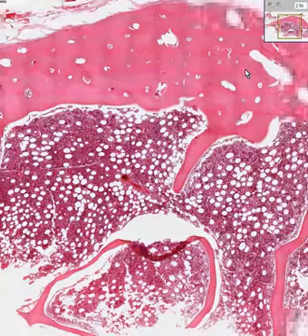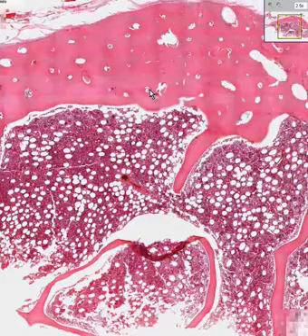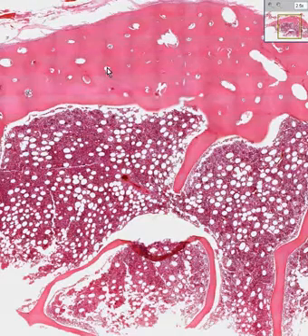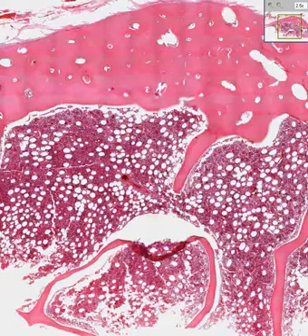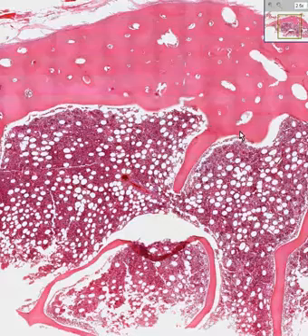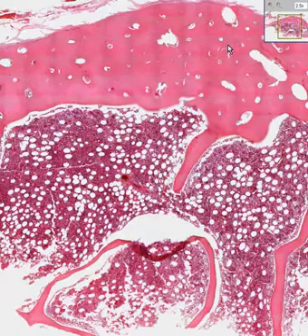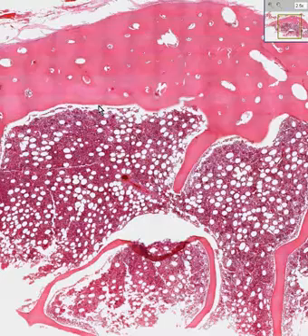We saw dense cortical bone out here with all of these holes being either blood vessels or part of the Haversian system, perhaps some Volkmann's canals. We could see some skeletal muscle out here. We could see some periosteum. We could see some endosteum on the inner surface. And we could see marrow as well. But in the last piece of bone, all we saw was a very dense piece of bone.